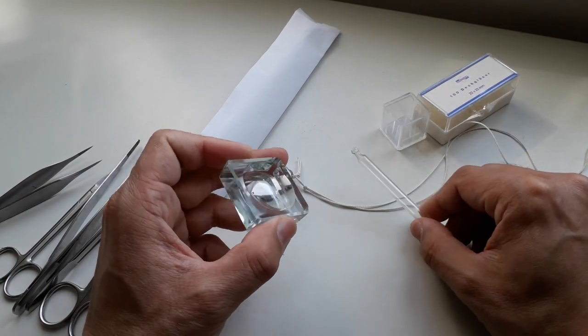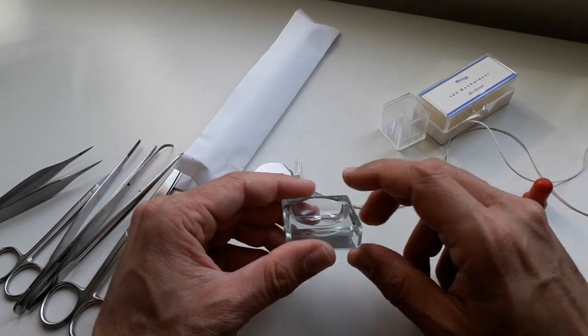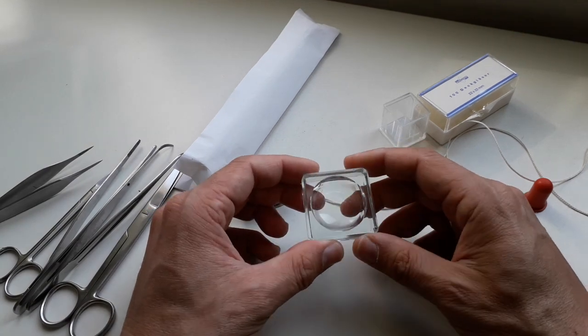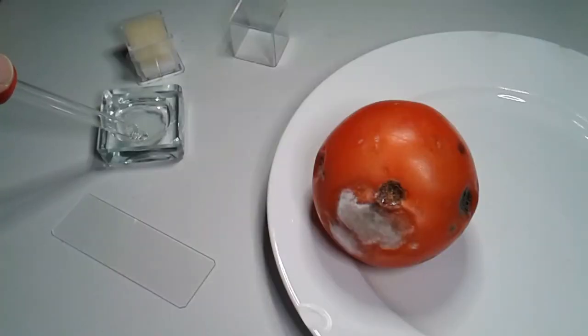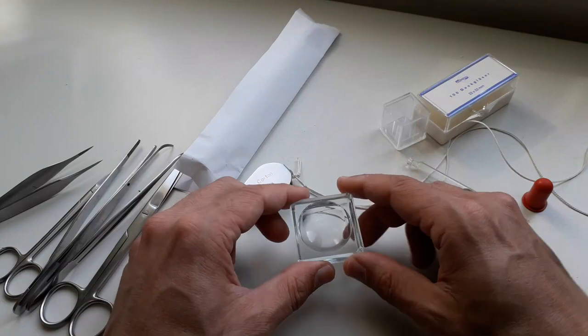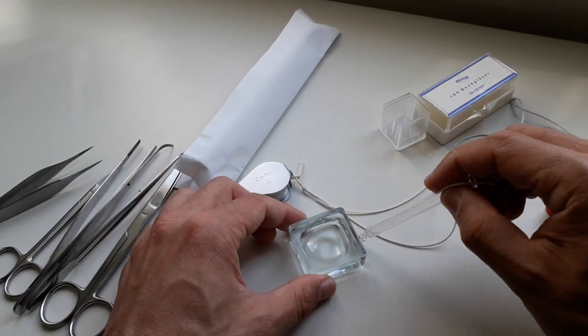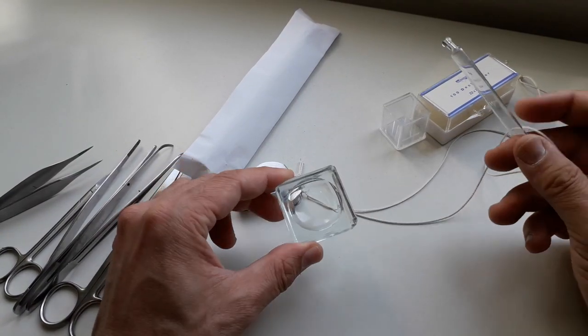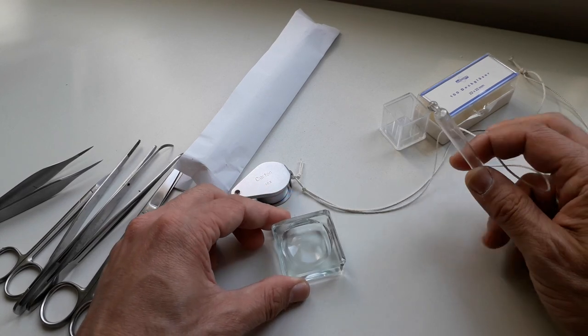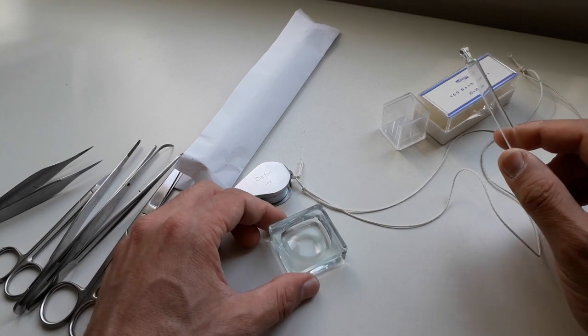This here is a glass container, a dish. I use this for two reasons: to carry some water when I make my slides, or sometimes I transfer the water fleas into this dish, and then it's much easier for me to take them out and transfer them over to the microscope slide.